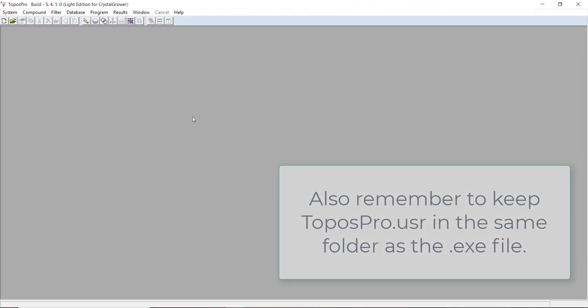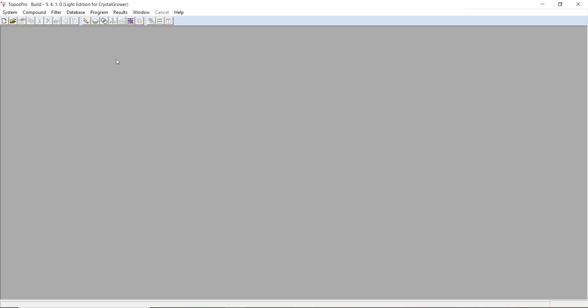When you open ToposPro, you're greeted with an interface like this. The main difference between the light version and the full version on the ToposPro website is the access to certain modules in ToposPro. The things that aren't available are greyed out on the top bar here.